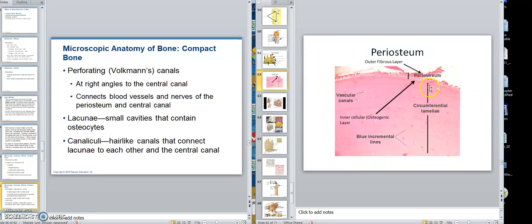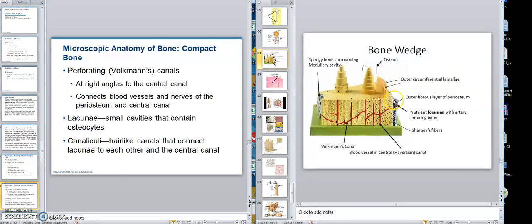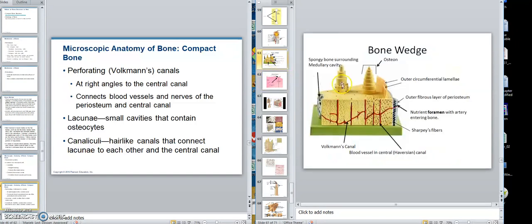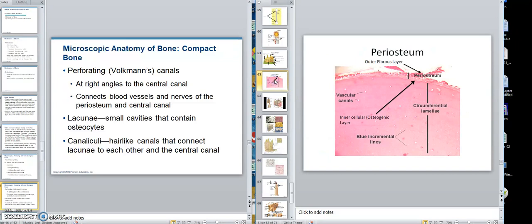Right here would be our circumferential lamellae. Because it's a slice, that's the circumferential lamellae. And this would be the little vascular channels that you would see, which would have been these here. So this is a stained section showing you that.